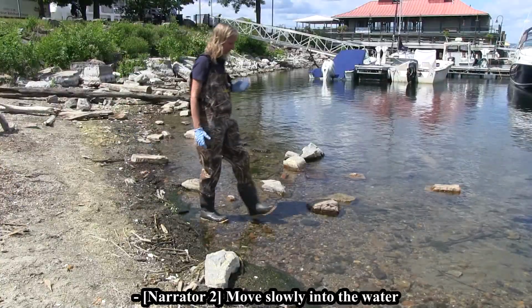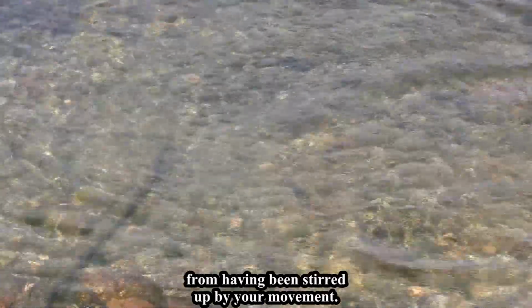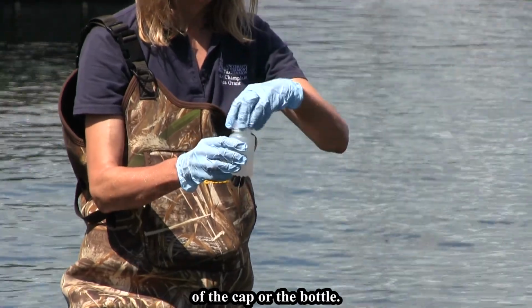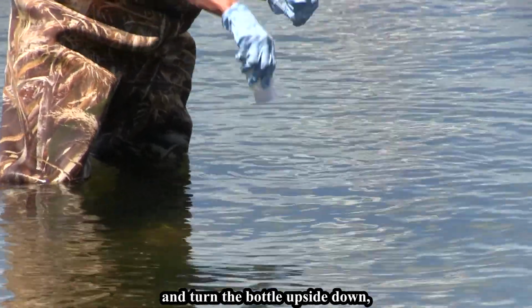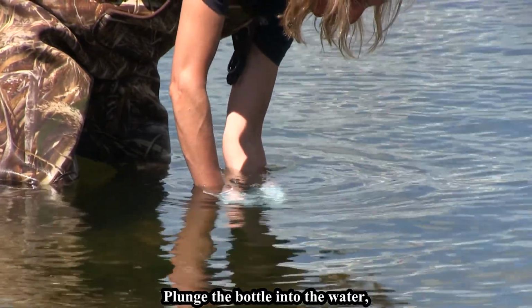Move slowly into the water to about knee deep. Allow the water to settle from having been stirred up by your movement. Open the sterilized sampling bottle, taking care not to touch the inside of the cap or the bottle. Reach out towards deeper water from where you are standing and turn the bottle upside down so the opening faces the water. Plunge the bottle into the water.